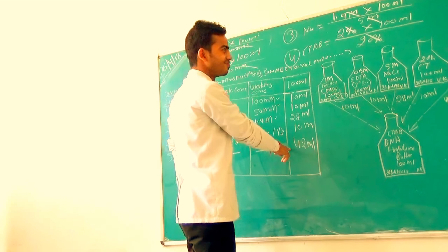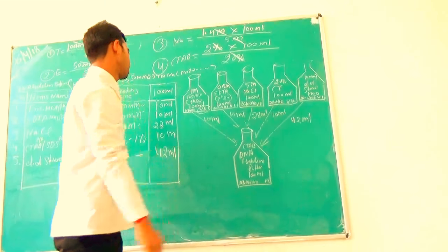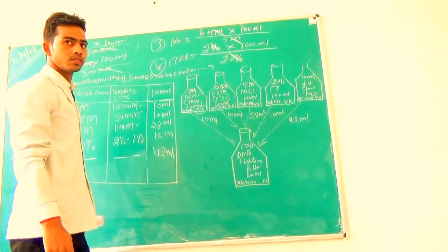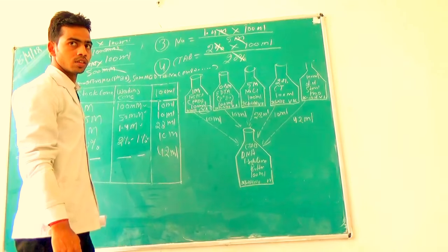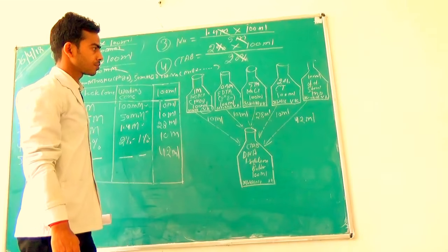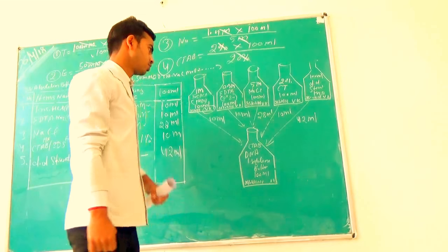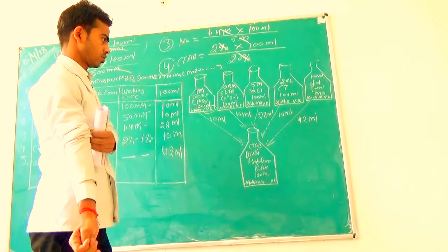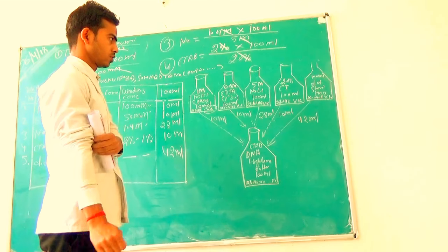Okay, next, explain this bottle. That was the table-based explanation. Now bottle-wise, figure-wise explanation here. All the 5 bottles are stock solution bottles, right? Same thing written over the bottle as written in the table. Now read all the table on the bottles and then explain.